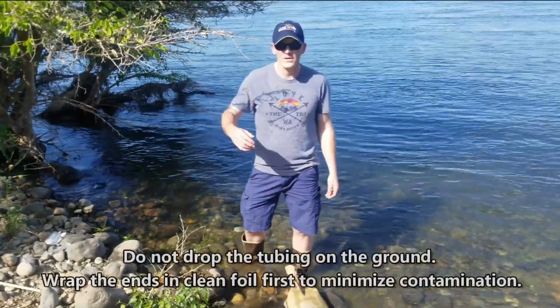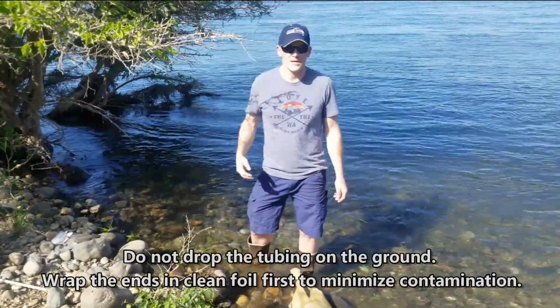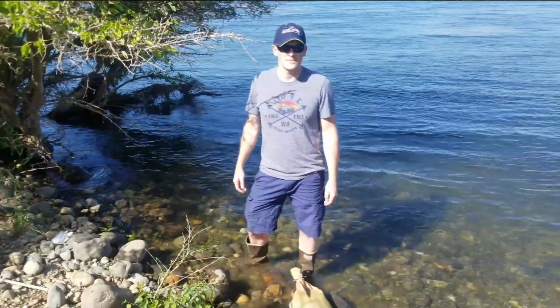After you've secured your middle lines, attach tubing to the other two push points and run them up to the same central location, weighting those down along the way with sandbags as well.